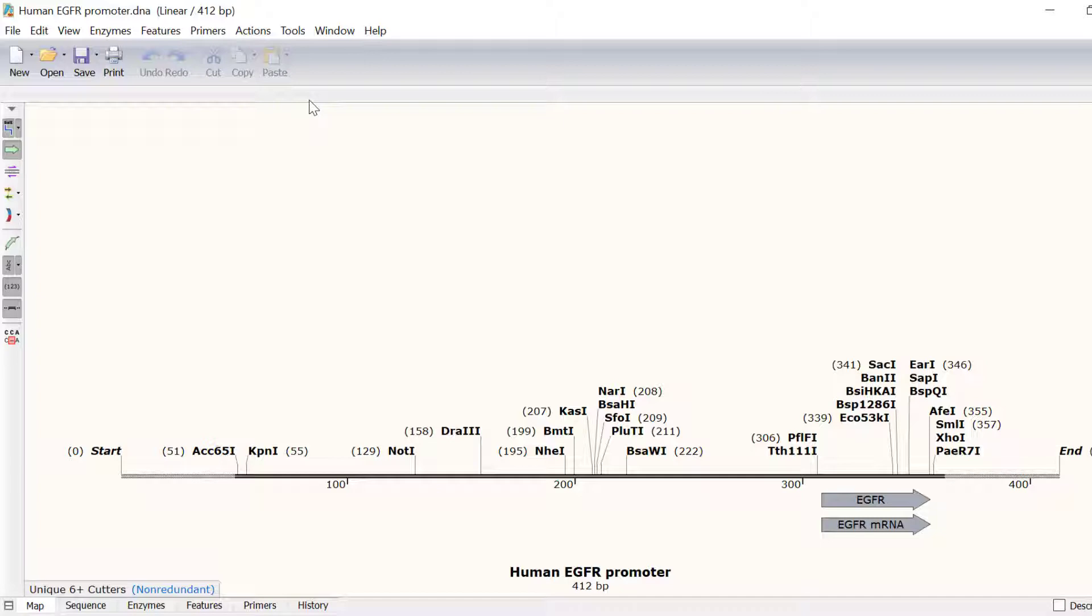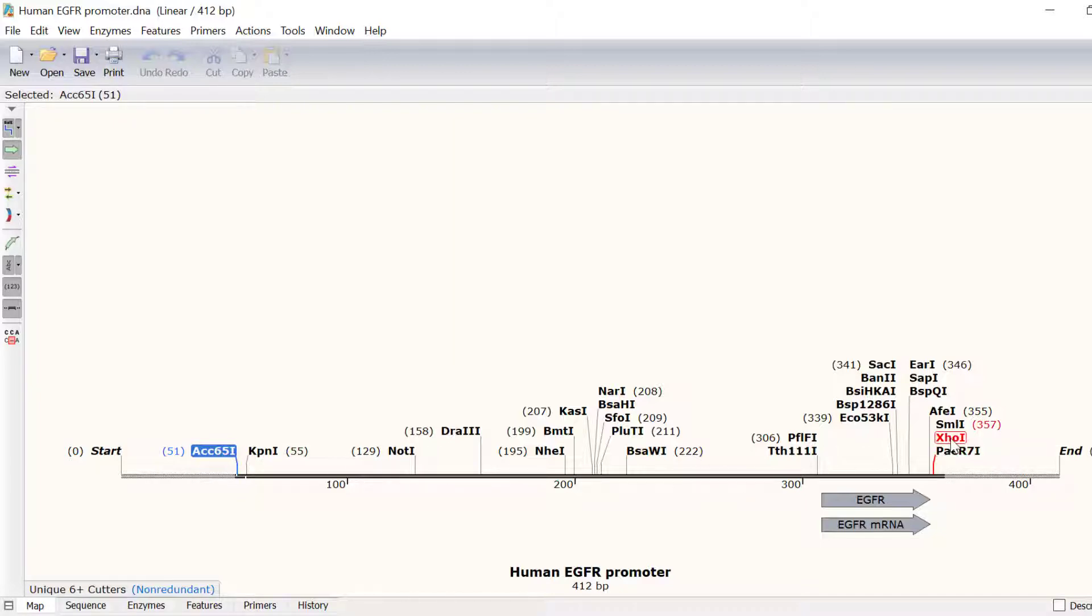I have identified the sites ACC651 at position 51 and XHO1 at position 357. In SnapGene, unique restriction enzymes are easily identifiable since they have bold text. You can also mouse scroll over the enzyme to see more information.